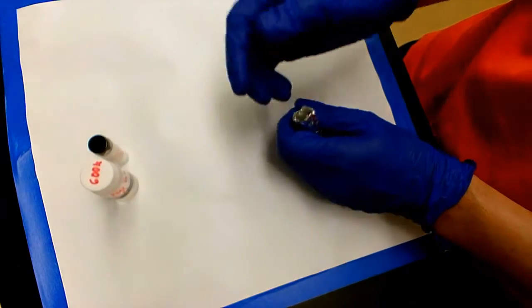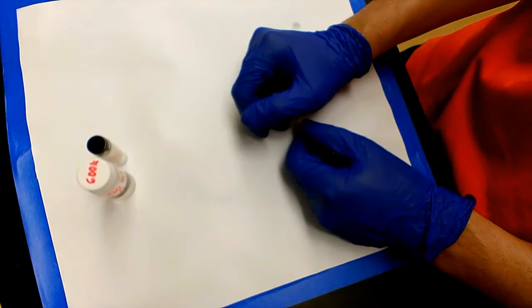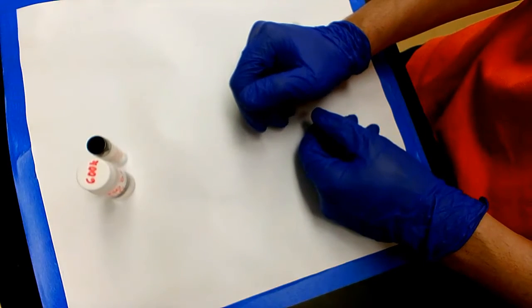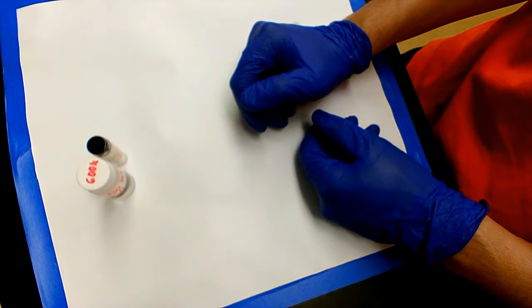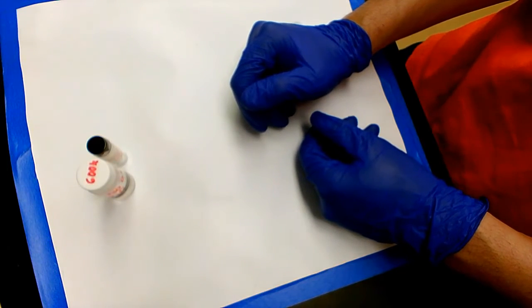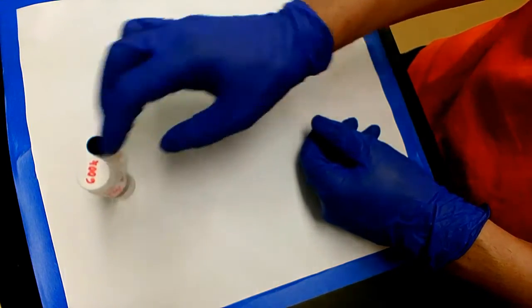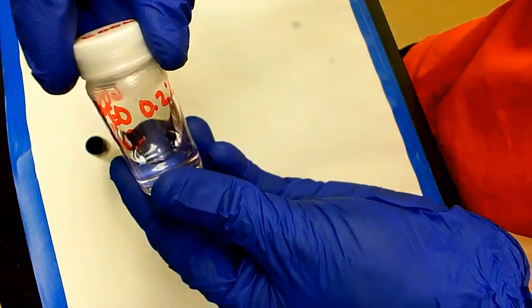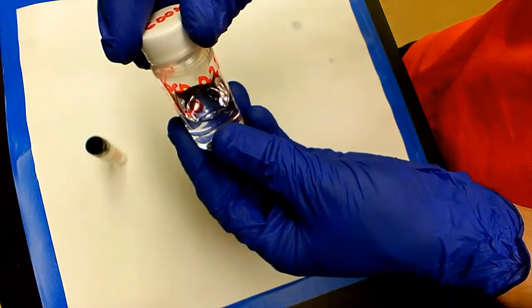So you want to do your math, right? Calculate the amount of the dye solution you need, and then how much of the polymer solution you need overall to make one drop cast sample. For each drop cast sample thin film, about 200 microliters of this polymer stock solution is sufficient to make a polymer thin film, right?